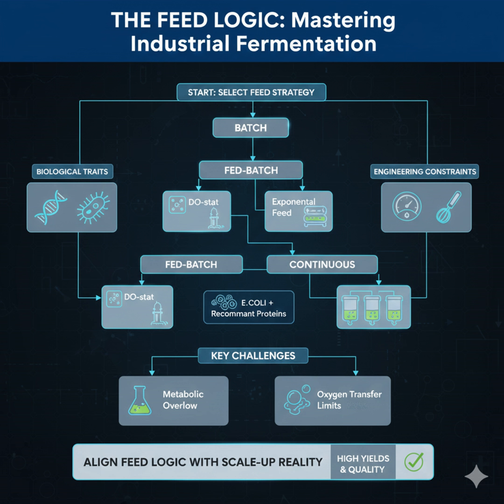We mentioned scale-up risks earlier, but I want to emphasize one point from the sources. The difference between local and bulk DO. Why can an aggressive feed lead to failure even when the bulk DO probe reads just fine? That's because of mixing limitations. In large vessels, the bulk DO probe might be located far from the feed injection point. So an aggressive exponential feed can create these local zones of high substrate concentration, leading to immediate localized oxygen starvation and overflow metabolism right near the impeller, even while the bulk fluid looks okay. And that localized stress generates toxins that still ruin the product.